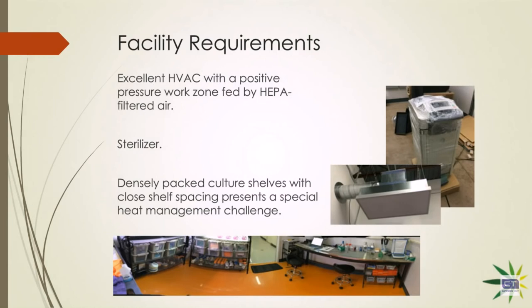Or as you show me the picture here, you can show me how simplified this little small workspace is that you were very productive in. And so, absolutely, yeah. It's somewhere in between. If anyone's a Michael Crichton fan, remember the Andromeda Strain and the disinfection procedure they had to go through? Exactly. That's an old movie nerd reference, but it's not necessary to go that extreme. It's not necessary to use a laboratory. You just have to have a very clean environment that's segregated from your main production facility.